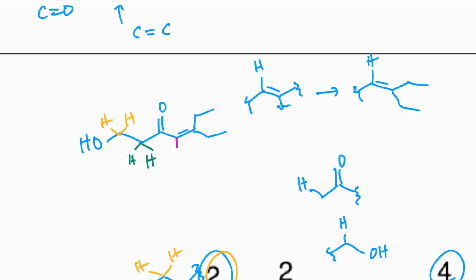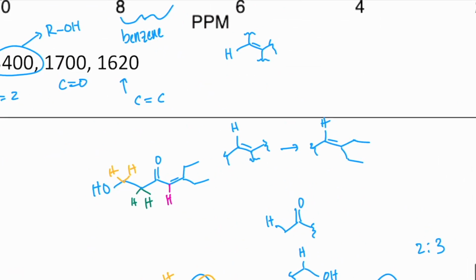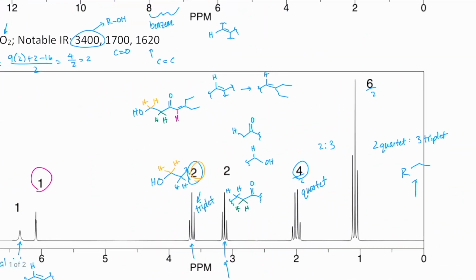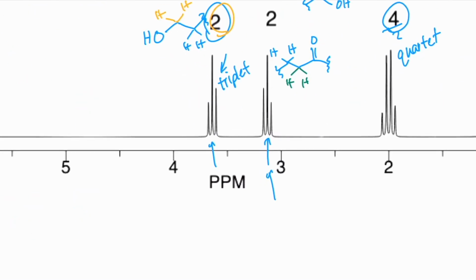We'll do pink. Let's see. Does our answer make sense? We have an alcohol with 2 hydrogens nearby with the correct match.